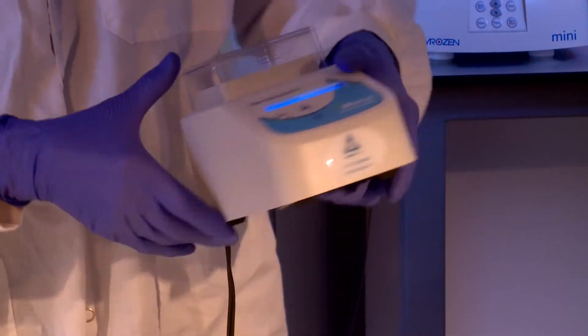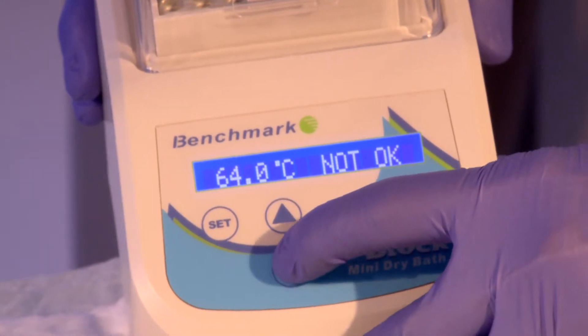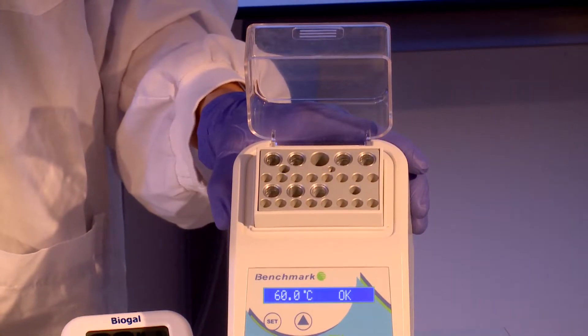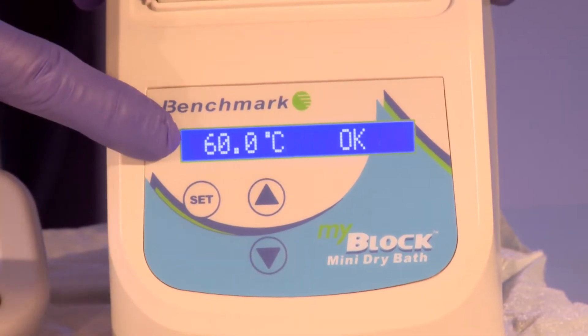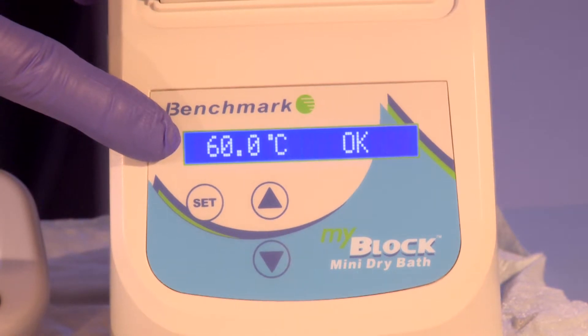Switch on the heat block and adjust it to the target temperature. In this case, we will adjust the temperature to 60 degrees. Once the block has reached the target temperature, continue with the reaction.